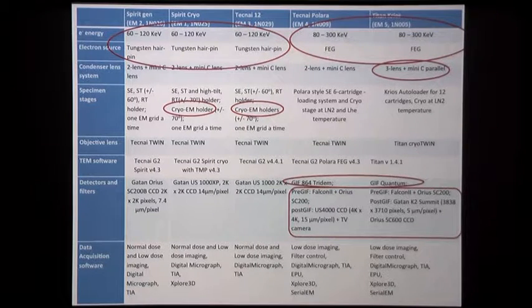Another difference is that this one has a different illumination system. We can more easily achieve the parallel illumination. On the other one you can also achieve parallel illumination, although it's not easy, but you can do it with careful setting.